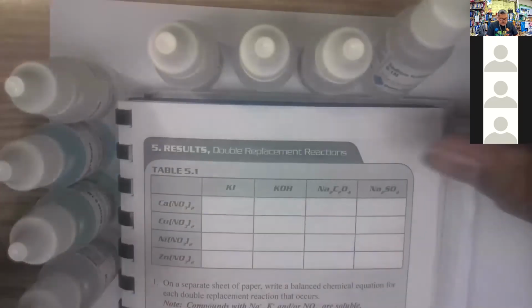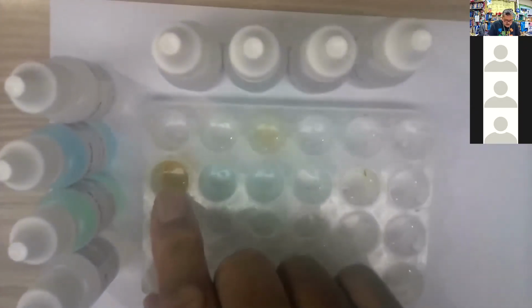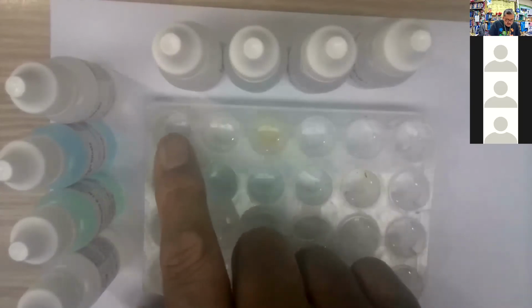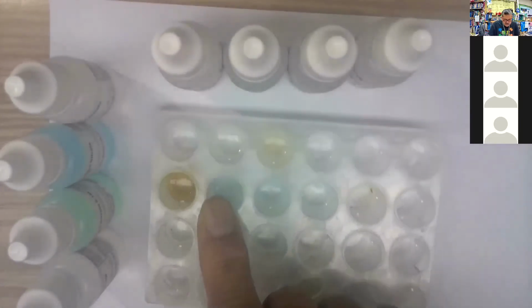So we got those chemicals, we saw the reactions, and if we take a look at the tray one more time, you see some of those are persistent. You got an orange color here in the second row. Second row, you have 3 different color changes. You have with the potassium iodide, the potassium hydroxide, and the sodium oxalate, all turned colors going that way.